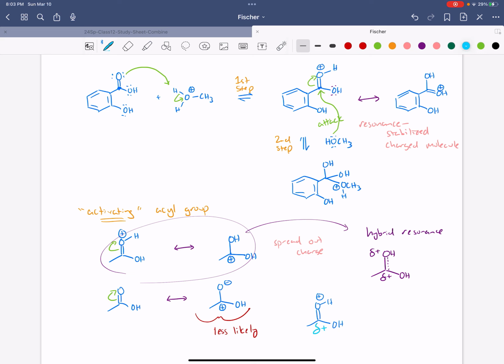We have run extractions with KOH. So in your aqueous layer, it's perfectly fine to write KOH, aqueous, like this. Or you could, not preferable, but some people are drawing a bond. I would not prefer that, but I wouldn't take off points for that.